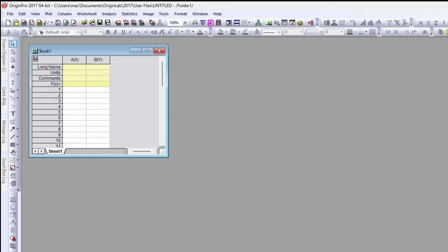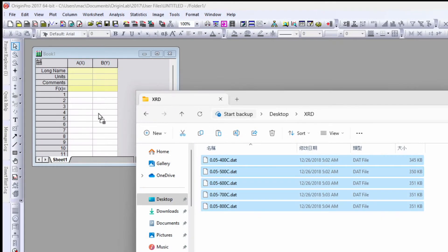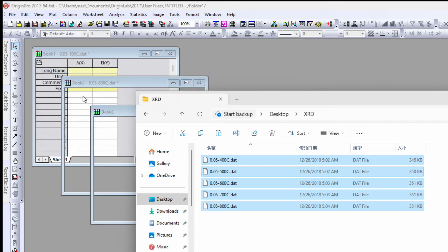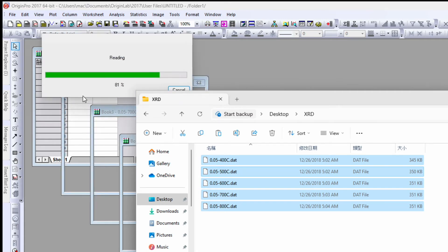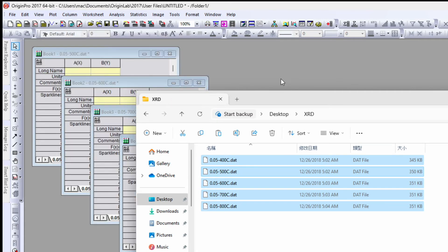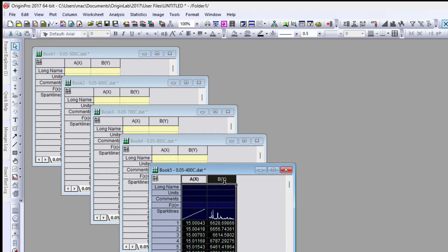In Origin software, go to the file folder. Here I have five data plot files. Select and drag them to the Origin software. Each file opens into a separate sheet, also called a book.